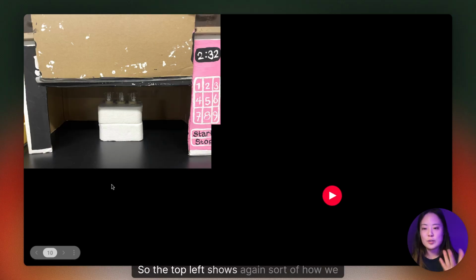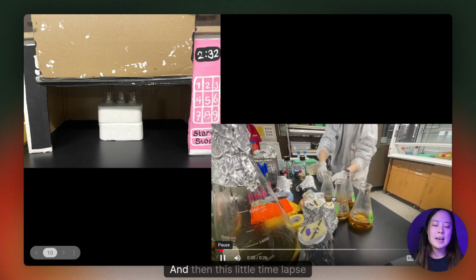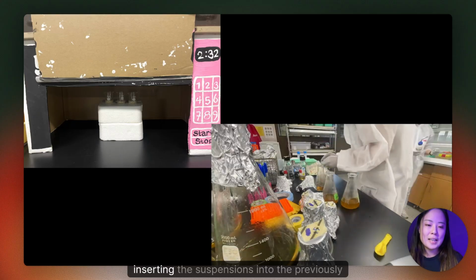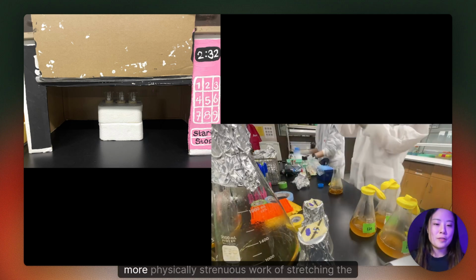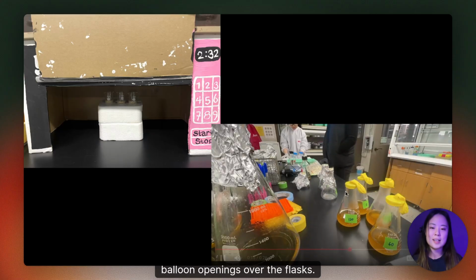So the top left shows, again, how we set up to expose the yeast suspensions to the UV light. And then this little time lapse shows me inserting the suspensions into the previously prepared flasks, and then Celine doing the more physically strenuous work of stretching the balloon openings over the flasks.